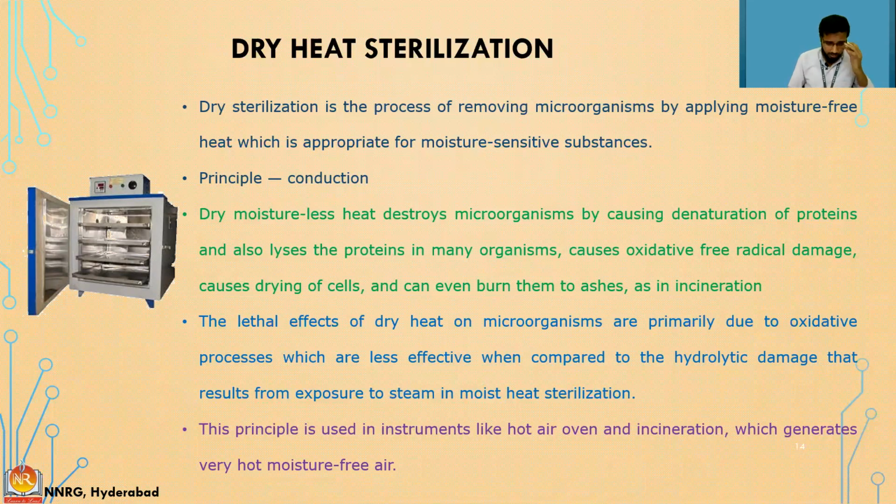Moving on with the dry heat sterilization method. Dry heat sterilization is the process of removing microorganisms by applying moisture-free heat, which is appropriate for moisture-sensitive substances. There are certain substances which are sensitive to moisture, which means they can absorb moisture. As a result, they get decomposed.